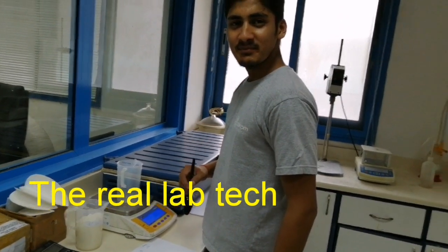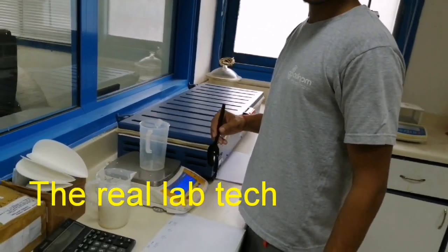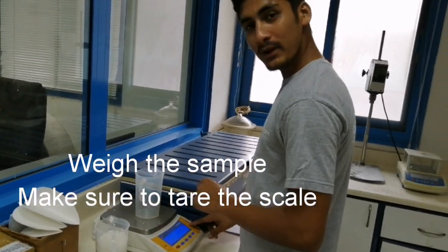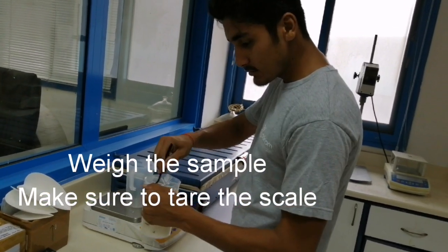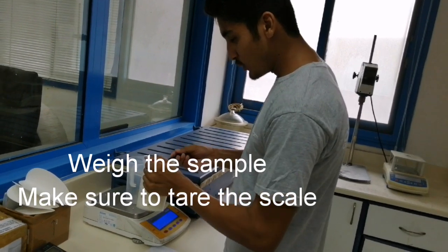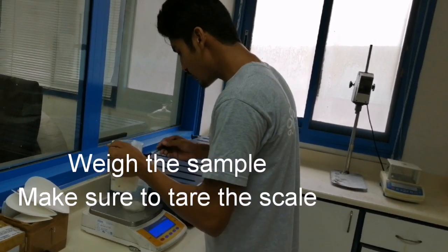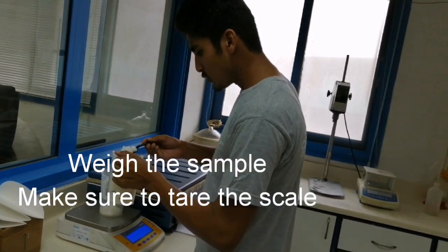The laboratory technician and we are continuing now our consistency test. So first, you take a sample and you have to weigh it. You make sure the scale is at zero. You mix the sample, and then you take some and then weigh it. So for every consistency, you are taking samples — depends on the procedure.